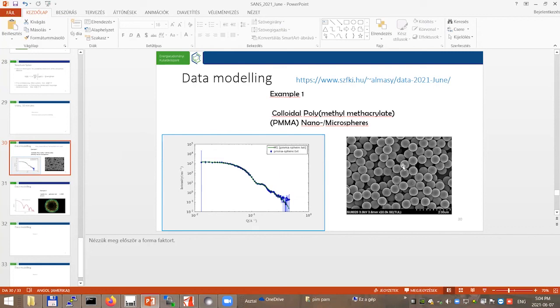If we use that kind of model, then of course from the fitting we can tell you what the maximum and minimum are, and how they distribute. So we obtain a size distribution, but we assume that we have this type of size distribution. Yes, thank you very much for your answer.